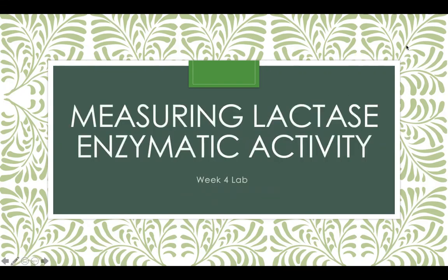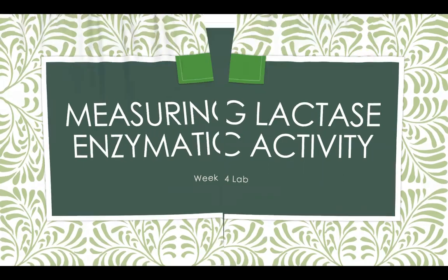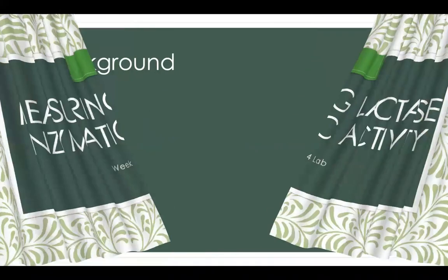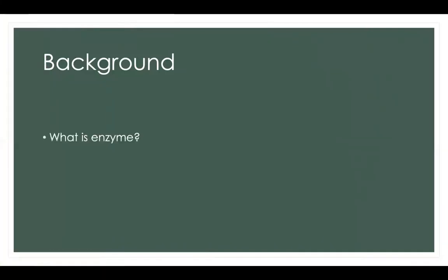In the lab I'm going to introduce, measuring lactase enzymatic activity, which we did in week 4 of the Bio 110 course. First, I'm going to introduce the background information. First, what is an enzyme?